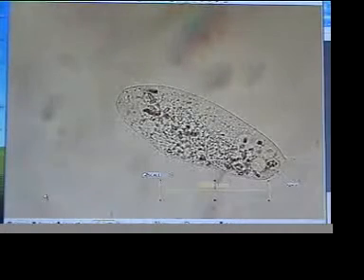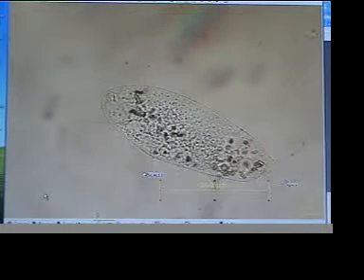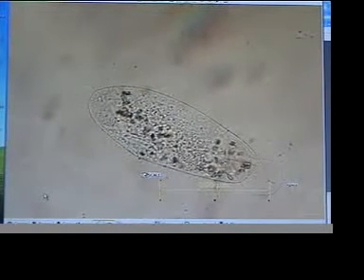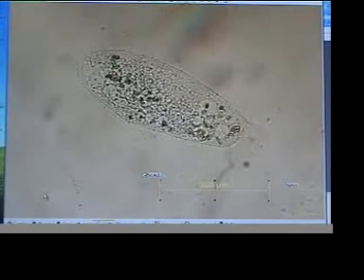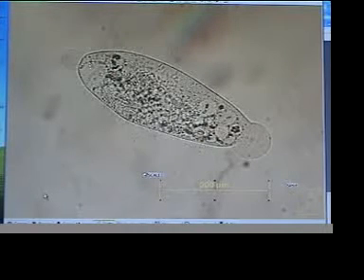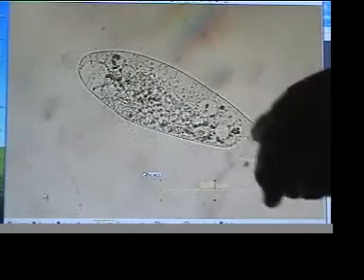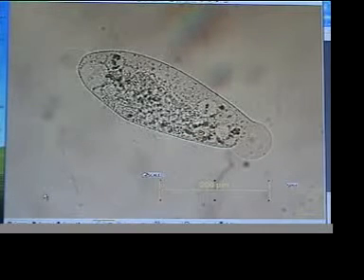Now watch carefully out the right end here. You can see that. I'll try to center the organism a little bit. And you see he's emptying his contents and it's forming a sphere. Let's see if we can focus it in a way that you can see the outline better. Now you can see the sphere is being formed. And of course, there's a blister on the other end as well. Here's a large sphere being formed. We'll watch this as it develops.